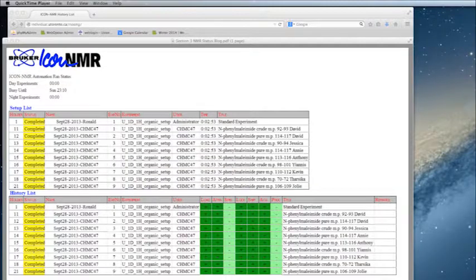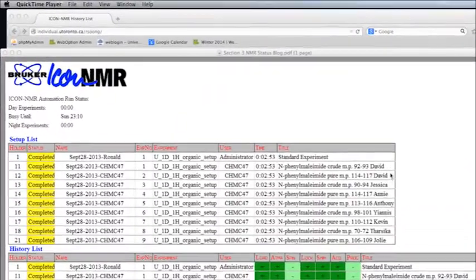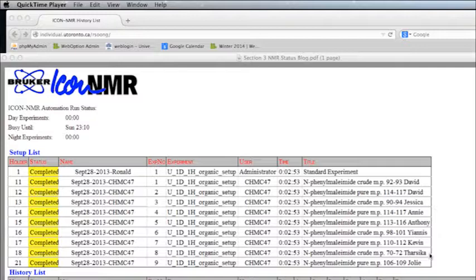When selecting a set of raw NMR data, an important thing to keep in mind is that you are likely using data from your peers, since not everyone gets the opportunity to run NMRs on their samples. The idea is to select the NMR spectrum of a compound with the melting point that is closest to yours and critically analyze the NMR spectrum as if it is your actual data. Melting point is a good indication of purity of a compound, and this information is generally indicated in the title.